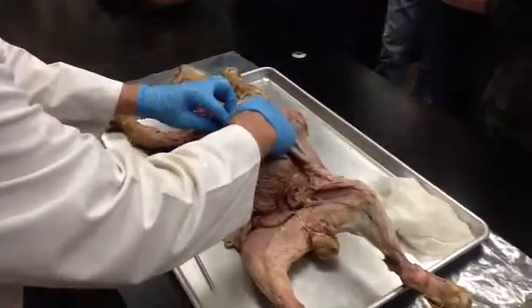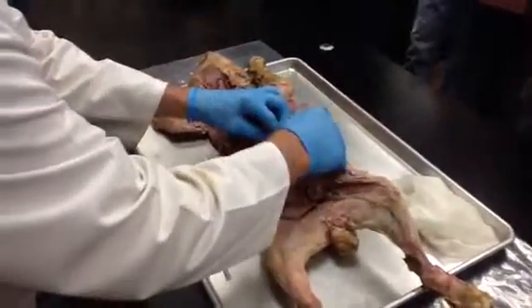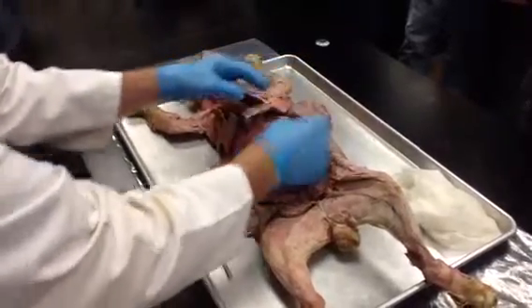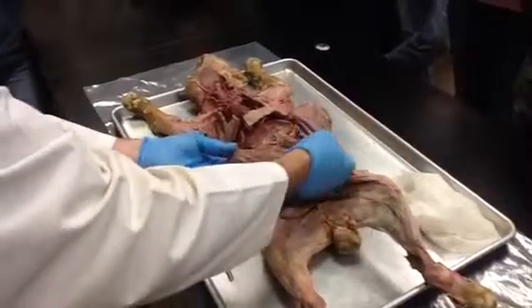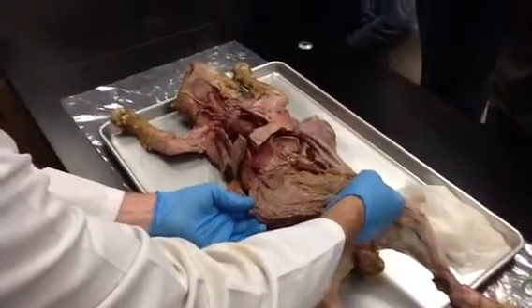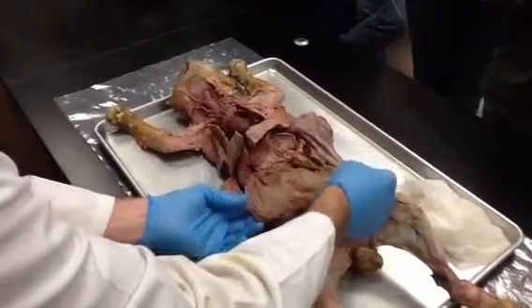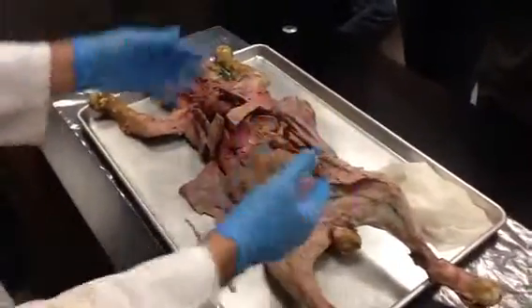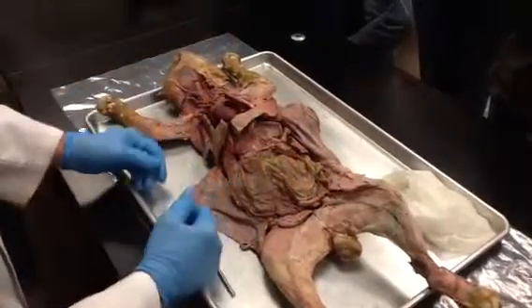Likewise, right here, all of this is the stomach. Over here, this thing that looks kind of like a tongue is actually the spleen. This is the spleen, this is the stomach. This big apron right here is what we call the greater omentum. The greater omentum covers the organs of the viscera. So if you ever had abdominal surgery, they have to work their way through this omentum to actually access the organs that are covered inferior to it.